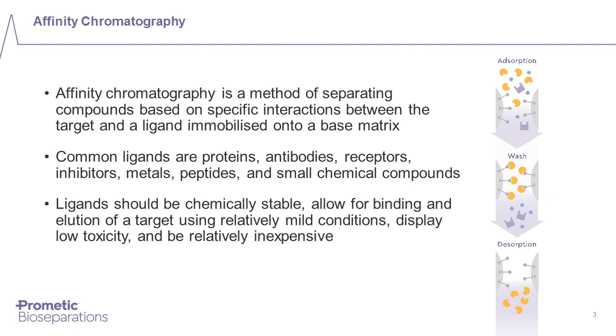It's a very short talk, so I just want to give very briefly, I think most people have heard this, the bases of affinity chromatography. As you probably heard, affinity chromatography is just a method of separating different compounds based on specific interactions between the compounds or the target that you're looking for and a ligand immobilized onto a base matrix.